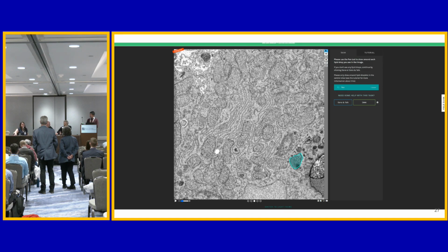And they'll tell you the specs on it, and you can play around with it, and you can get a sense of performance in any of those tools. And then if you find yourself, okay, this is the thing I'm using, this is about how much compute it's using, you can do that in an informed fashion. Good GPUs, good memory is good. A lot of stuff is still, unfortunately, CPU bound, so you need all of it to be decent.